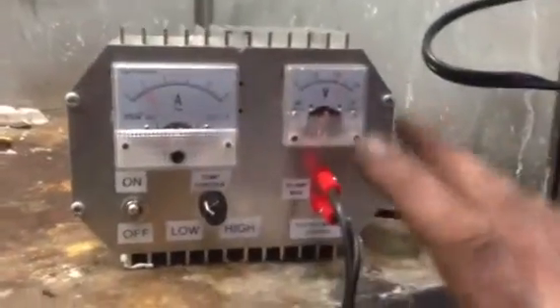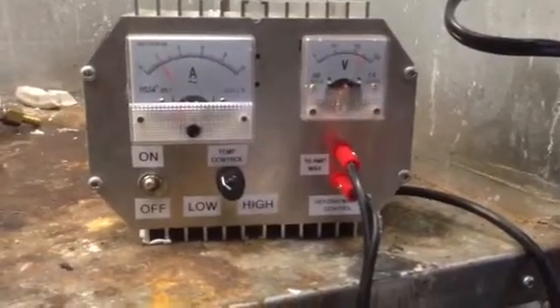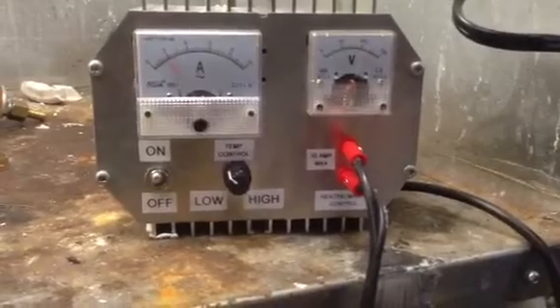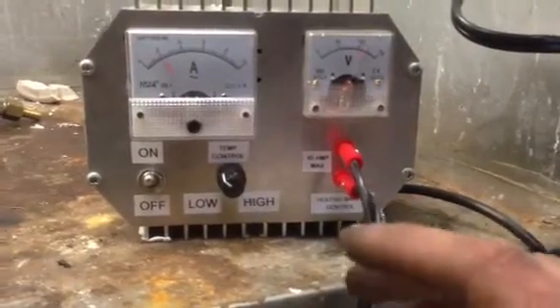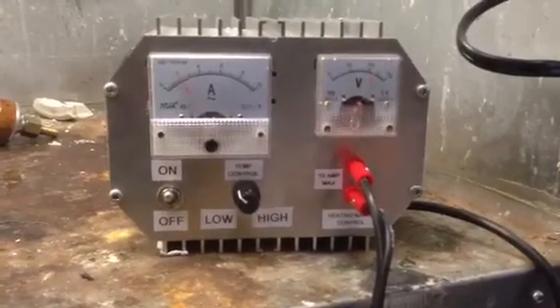This is probably because I'm using a 16 amp rated TRIAC. If you doubled up a few 5 amp or 3 amp rated TRIACs you would have better results. But I wanted this thing to be durable, last a long time, be able to run cool, not hot.